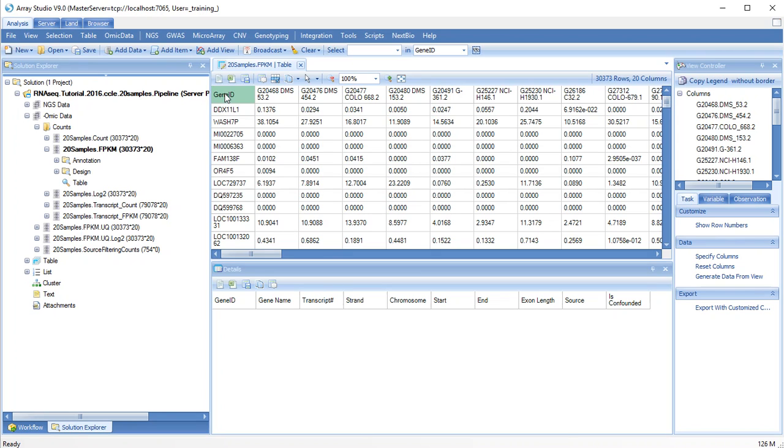Basically, for each gene, the RPKM, FPKM, or count data for each isoform is measured as a fraction of the gene's total expression level. A t-test is performed between groups of samples to identify which genes have different transcript usage between samples, irrespective of absolute gene levels between samples. It's important to point out that the p-values reported are not false discovery rate adjusted, but the rankings by p-value will still give you the largest differences in relative transcript usage.